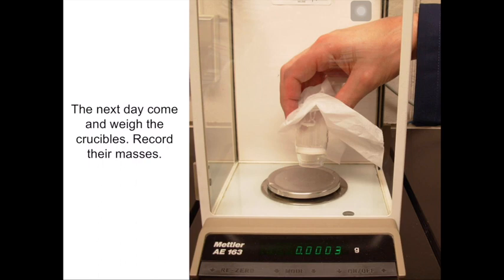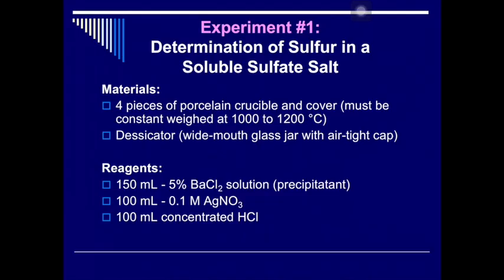Okay, so this one is another experiment which you will not be doing in the lab. What we will be doing in the lab is this experiment. The title of your experiment is Determination of Sulfur in a Soluble Sulfate Salt. Basically, you will be given an unknown sulfate salt and you are asked to determine the percentage of sulfur in that particular salt using gravimetric analysis.